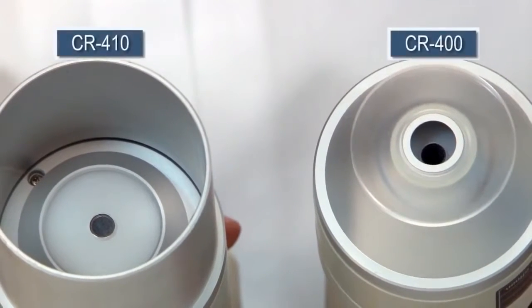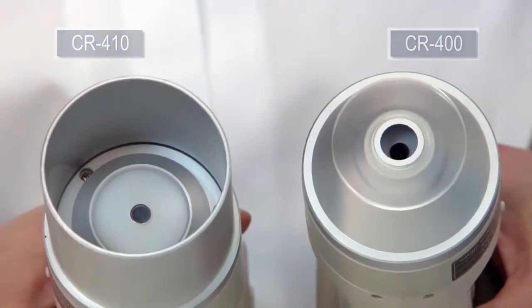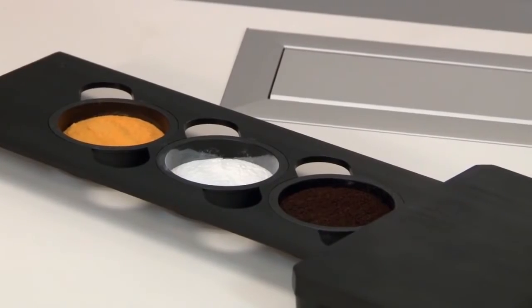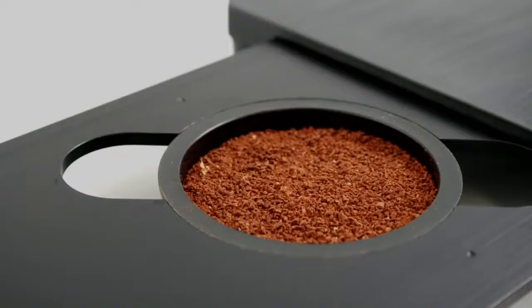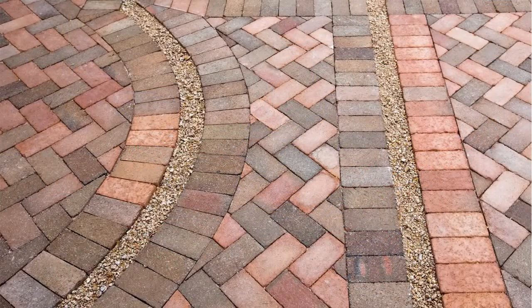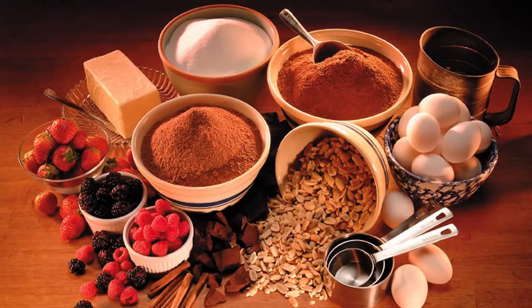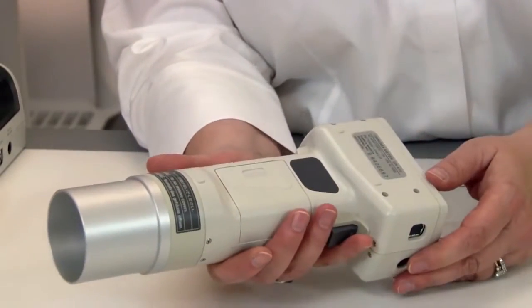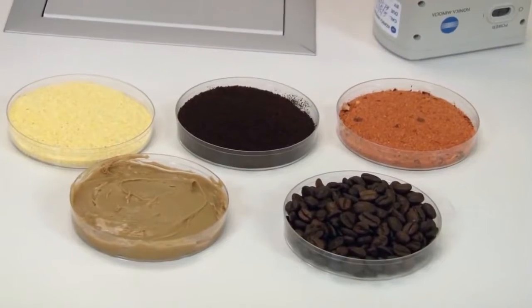The CR400 colorimeter features an 8mm measurement area while the CR410 features a 50mm area. If samples are non-uniform or uneven in surface such as granulates, fabrics, wood, stones, bricks, and foods, then the CR410 is the right choice. Its unique, large aperture of 50mm is perfectly suited for such samples.